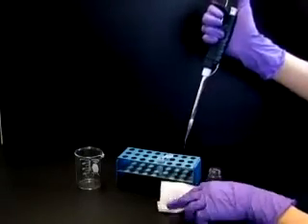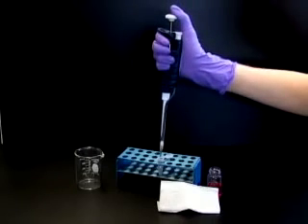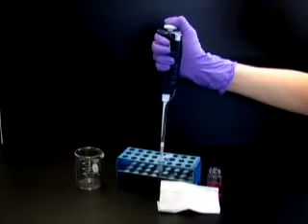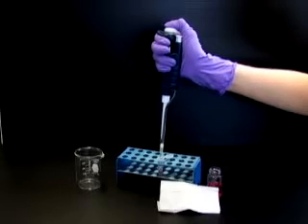To dispense the liquid in the pipetman, touch its tip to the side wall of a new container and slowly depress the plunger to the first stop. Wait a few seconds to ensure complete sample flow. Then, press the plunger to the second stop to expel any remaining liquid.